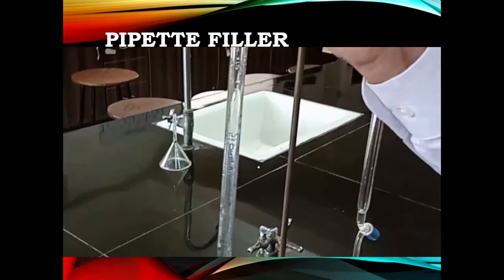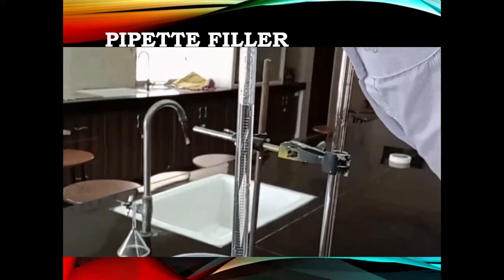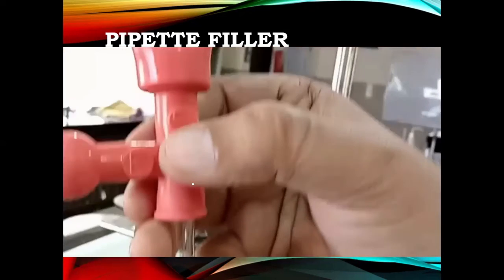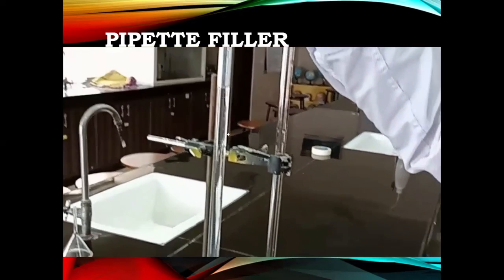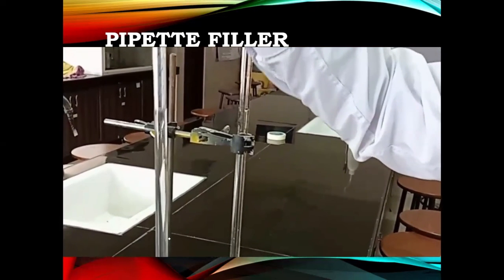And now when we press S, it will suck the liquid. See, it is sucking the liquid. Now from E, we can drain it. Now it drains the liquid, ejects the liquid. Okay.